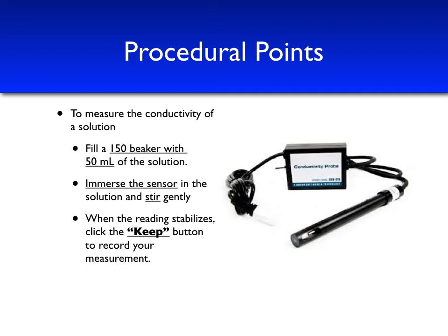You'll notice in the video that the last digit, which is our uncertain digit, will fluctuate a little bit. Typically in this experiment, we collect class data and calculate averages and standard deviations of the mean. For this lab, we're going to actually leave that out a little bit. It is also important to avoid contamination by rinsing the sensor with deionized water between measurements. This will actually be done in the experiment by swirling the sensor in a beaker of water before putting it in the next sample.